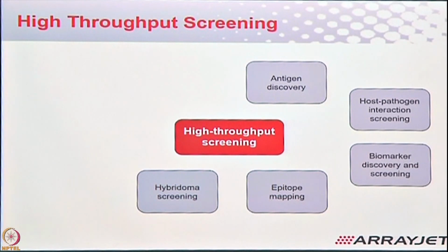to develop projects around hybridoma screening, where you have your lysates, they get printed off on one layer. So different lysates get printed off on different slides. Then you have your target antibody of interest that gets printed on top of each other. So you can imagine there is a spot and then there is another spot on top. And because of that binding of one spot to another spot, it's called a spot-on-spot assay. So it's a spot-on-spot type of printing, where you can make sure the entire interaction or the screening is done while it's getting printed.